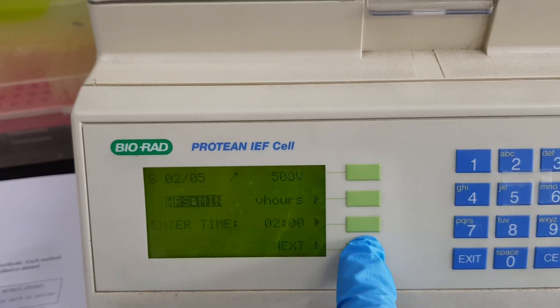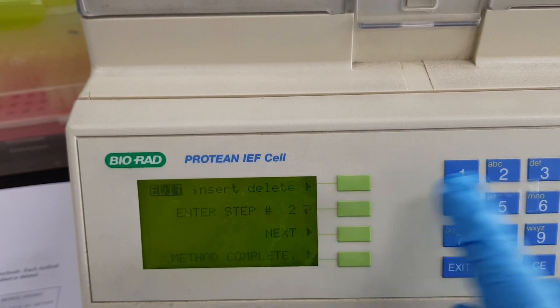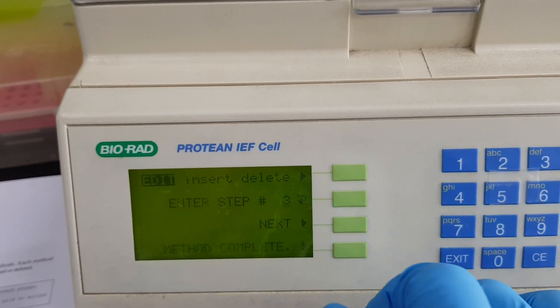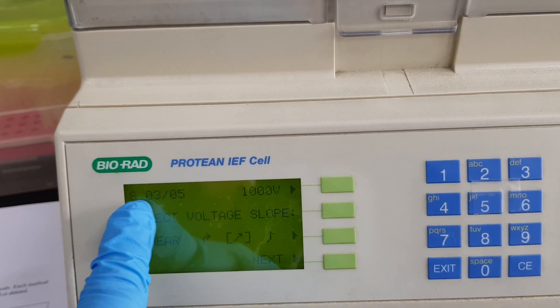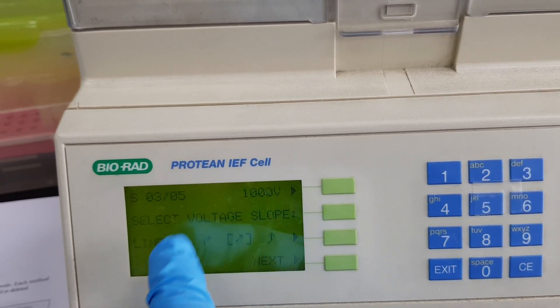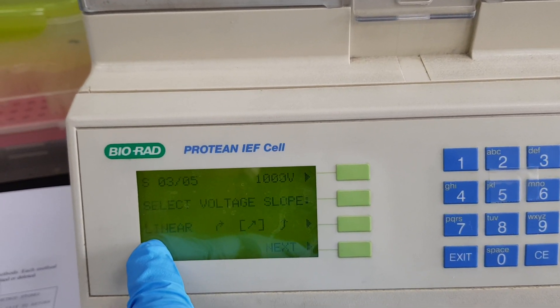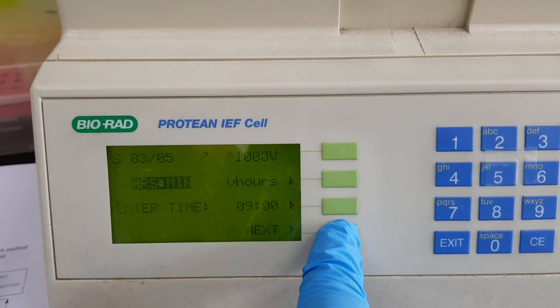For 500 volt I want two hours, so I select two hours and press next. Now we go to step number three. This is step three out of five and my step three is 1000 volt. I have also selected the linear voltage here and will move to the next.